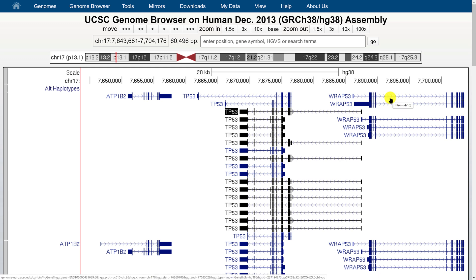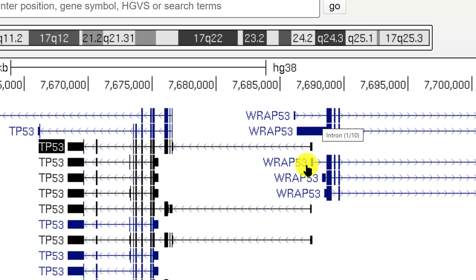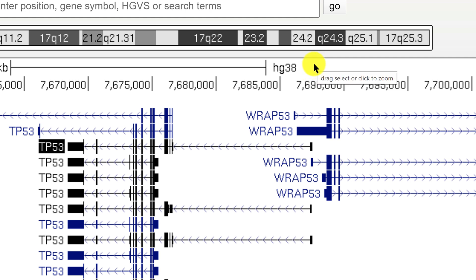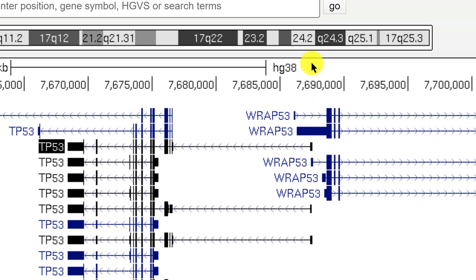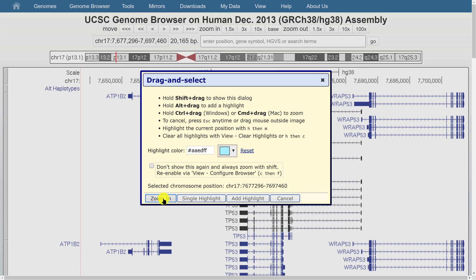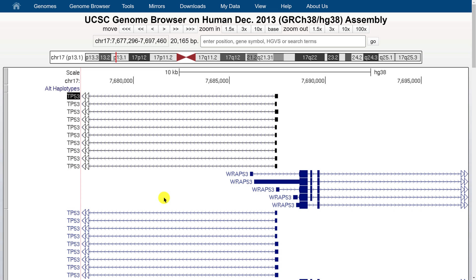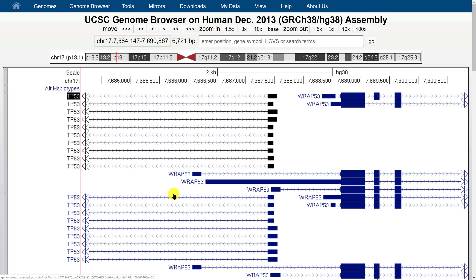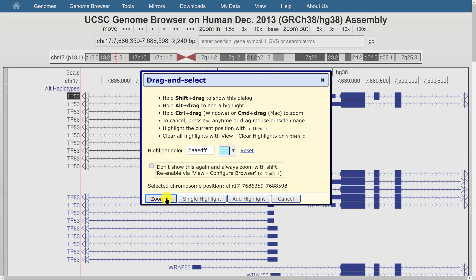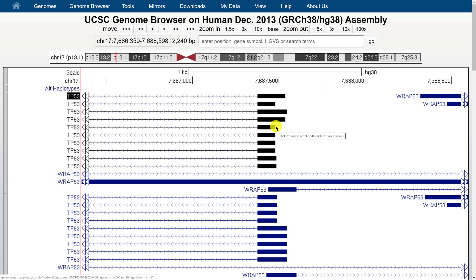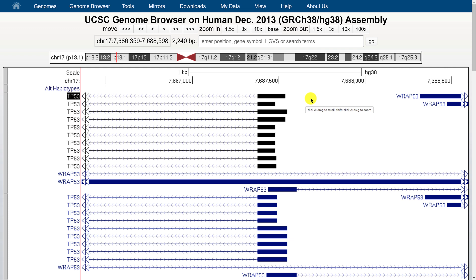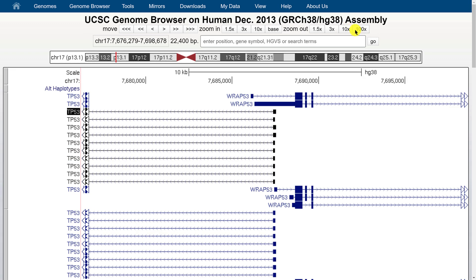You can also center the browser on a specific point — for example the p53 promoter on the right side of the window. Just click at that point on the scale bar at the top, and it will zoom in 3x and center on that position. You can keep clicking to zoom in closer and closer, getting right down to the UTR of p53.